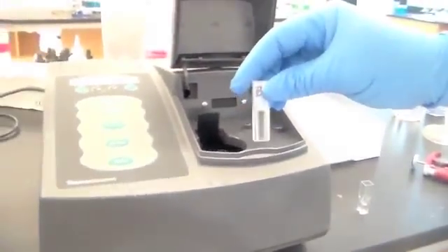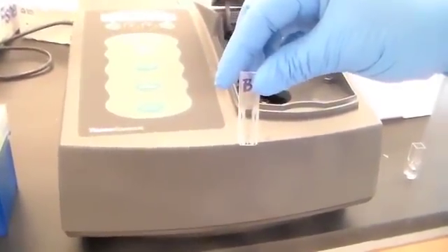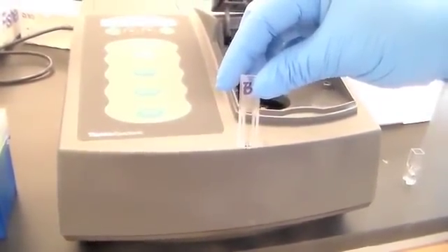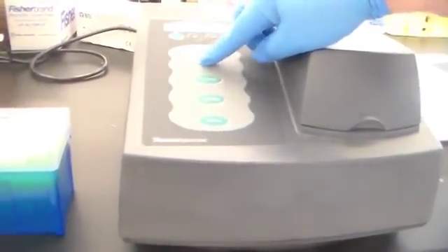I have a blank, so this is a cuvette that has the sterile media that the E. coli is growing in, but no E. coli have been put in here. We're first going to blank the machine so that if there is any innate absorbance to that M9 minimal media, we can tell the machine that it's 0. So I put that blank in there, and I'm going to hit this button that says 0 absorbance, and it's going to set the machine to 0.